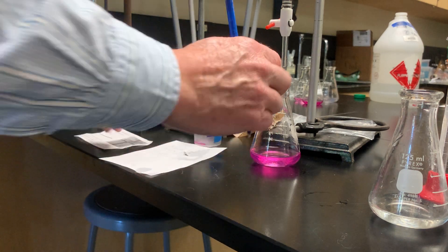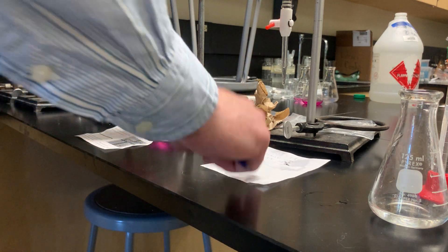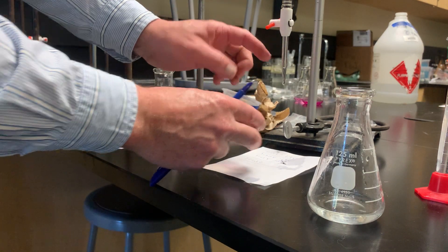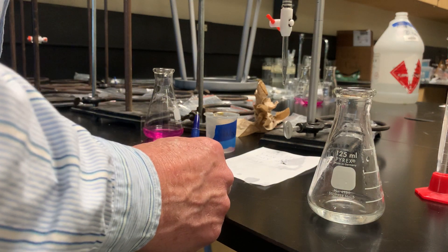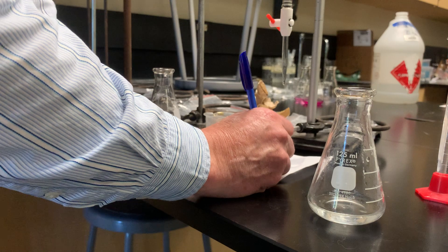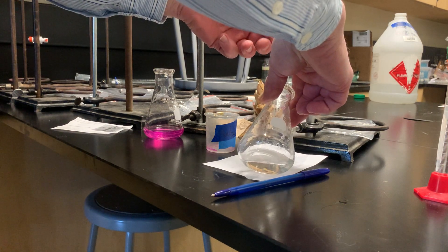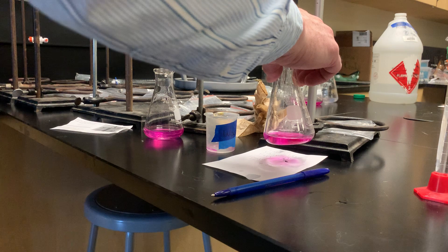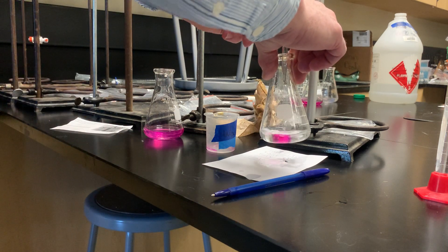As you do the trials, you tend to get better and better. That pink color is not too bad. For trial two, I see my tip has emptied again and has some air, so I'll empty it out. Then I quickly read my beginning volume. The last time we added about seven milliliters, so I'm going to add six milliliters quickly, which would bring us to about 15, and then after I get to 15, I'll slow down.